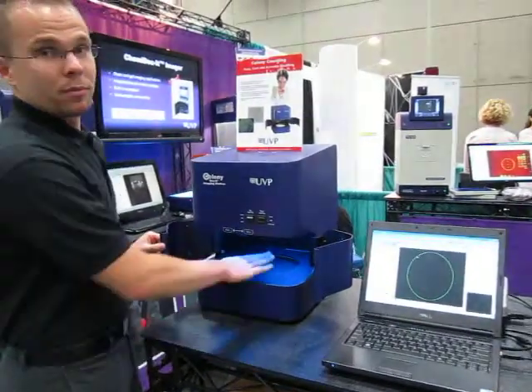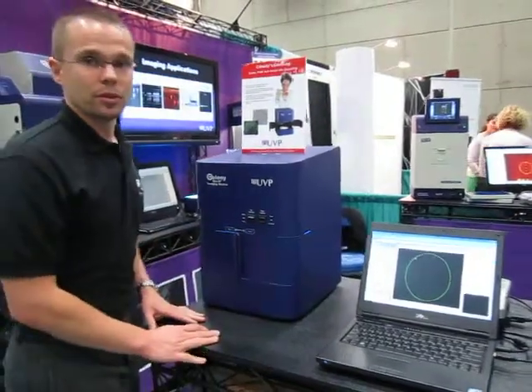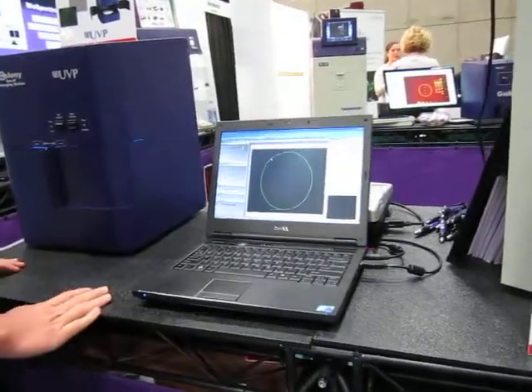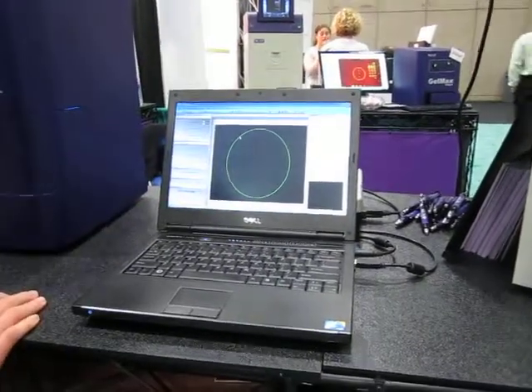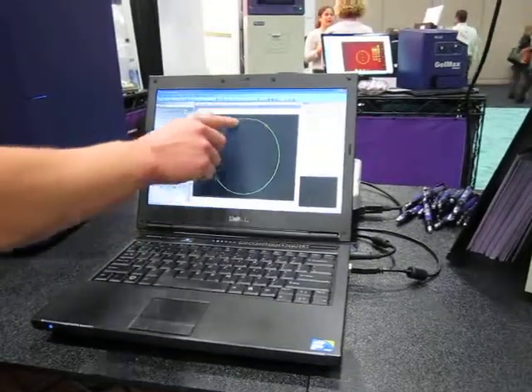Once the sample has been placed within the system and the correct lighting has been selected, simply close the darkroom doors and head over to the software here — our Docket Colony Count software. From here you can capture the image using the integrated camera. Once the image has been captured, it will show up on the screen and you can select your region of interest. You can see here we've already selected this region of interest, which is the green ring there.